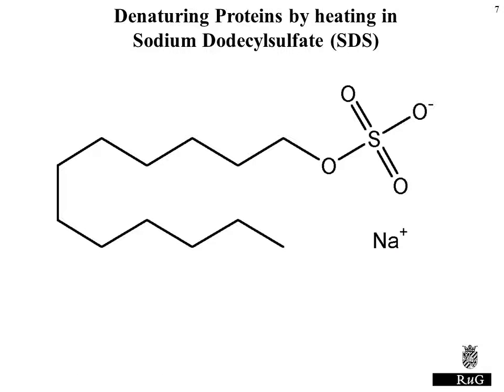We talked quite a bit about sodium dodecylsulfate, SDS, and its importance to confer equal charge density and equal electrophoretic mobility on all proteins in the absence of pores. So let's take a look at the molecular properties of SDS. It's a fairly simple molecule, composed of a hydrophilic sulfate head group and a hydrophobic C12 carbon tail. It's usually provided as the sodium salt.